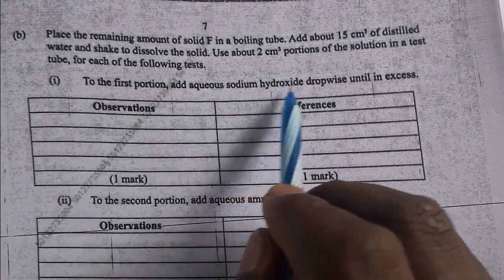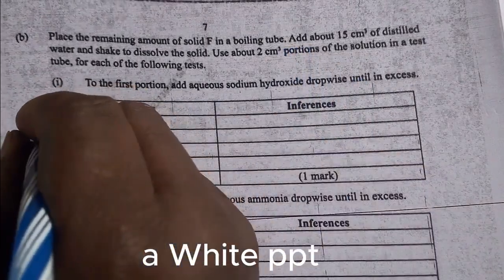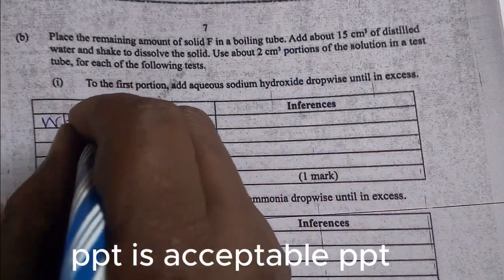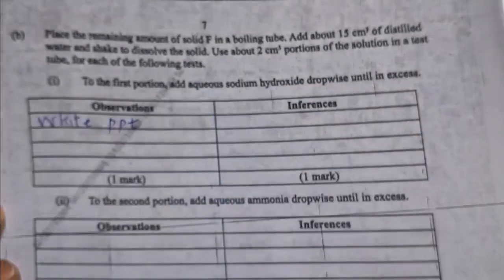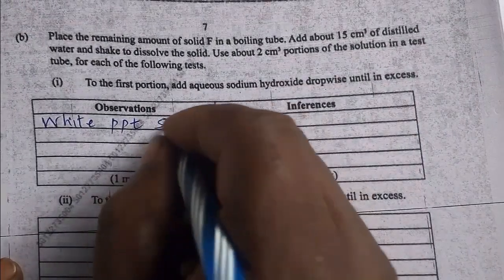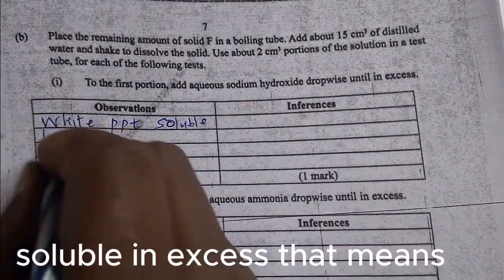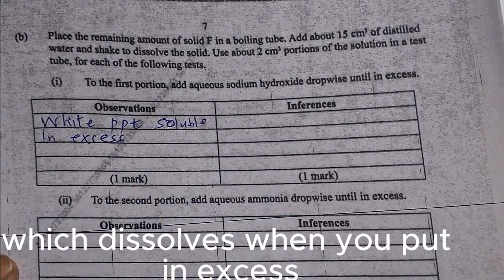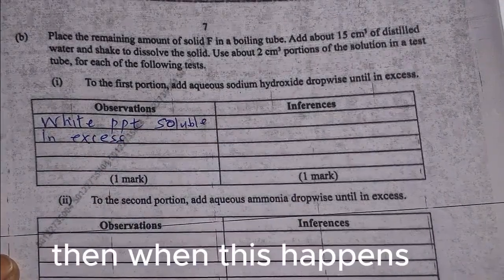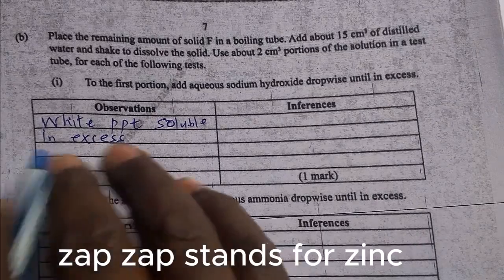A white precipitate was formed, which was soluble in excess. A white precipitate is formed which dissolves when you put in excess. When this happens, you should know that what is present is the ZAP.